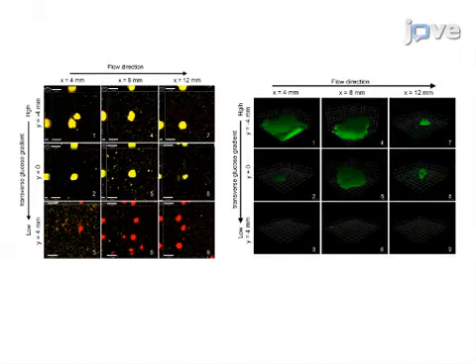Solute transport and particle tracking analysis of the resulting data demonstrate the utility of this method in assessing biofilm processes under various chemical environments within a single device and in one set of experiments. The main advantage of these methods is that they allow for the simultaneous assessment of multiple aspects of biofilm environment interactions. The methods reported here can help answer key questions about biofilm formation in natural environments or in biofilm-related infections.